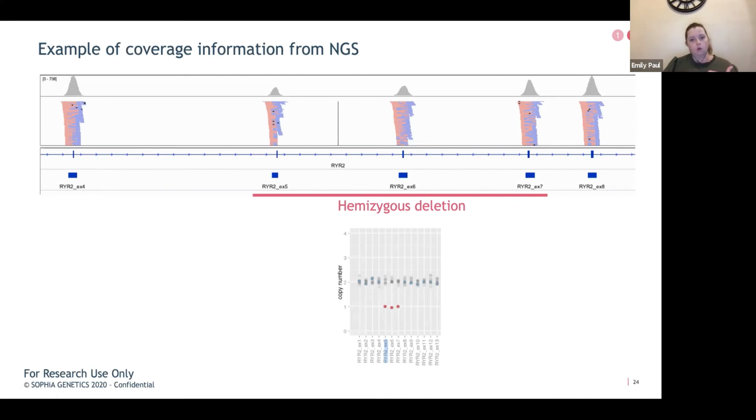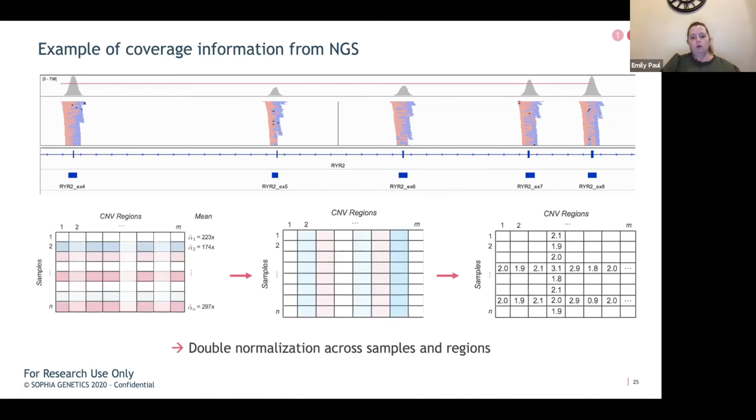Remember, I mentioned the noise of the processing of samples actually gets included. But then we're also going to look by region itself. And those 2 normalizations are actually quite important to be able to confidently go forward here. Now, what we're looking at is still that screenshot, but of course, across the top, we see this pink line inserted to be able to identify a normalization baseline. And we are able to normalize across this whole region, across the samples as well.